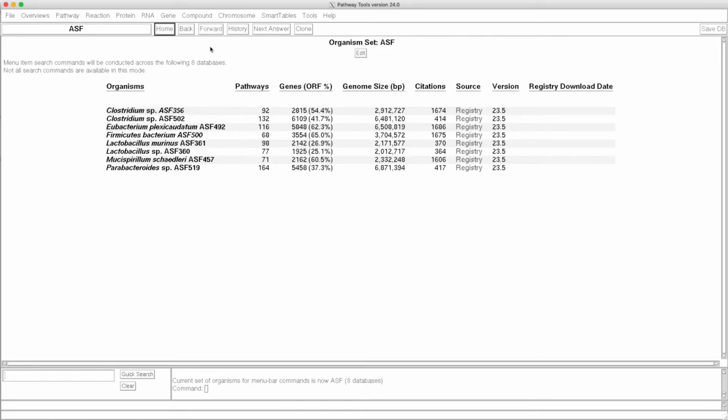If we click on spermidine for that organism, we'll see the reactions and the pathway that it's in. Notice one of the reactions is a generic reaction not involving exactly spermidine. That's why only 2 reactions were listed previously. Now let's go back.